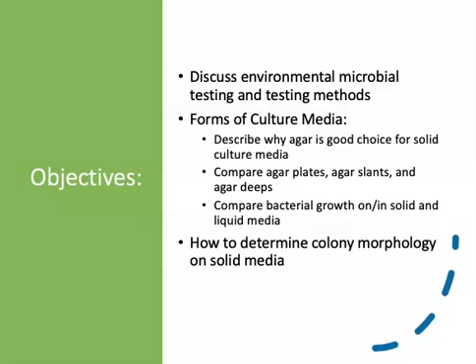We'll compare how agar is used in the microbiology lab, in agar plates, agar slants, and what are called agar deeps. We'll compare bacterial growth on and in solid and liquid media so you can see the differences. And finally, we'll talk a little bit about colony morphology and how to assess it on solid media.